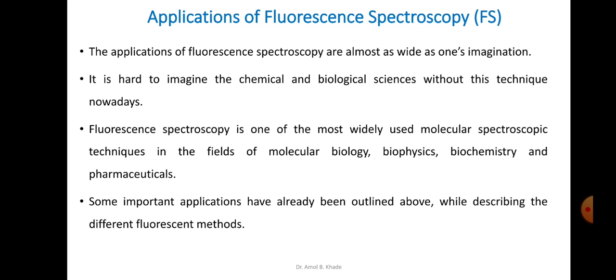It is very hard to imagine the chemical and biological sciences without this technique nowadays, because of the modernization and sophistication in liquid chromatography and even in the instrumentation of fluorescence spectroscopy. Fluorescence spectroscopy is one of the most widely used molecular spectroscopic techniques in the fields of molecular biology, biophysics, biochemistry and the pharmaceuticals.